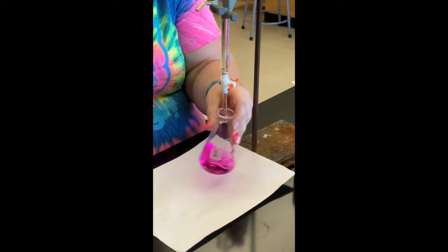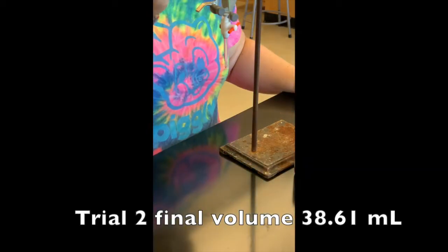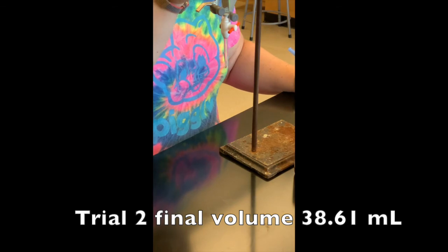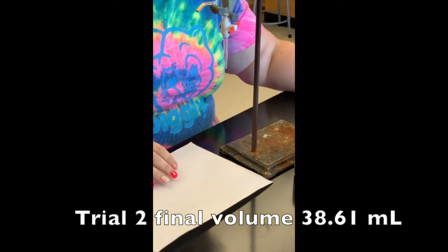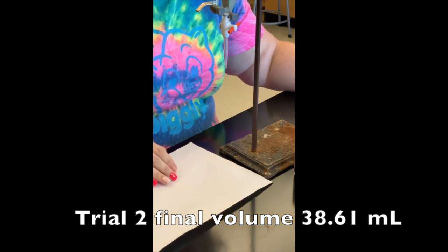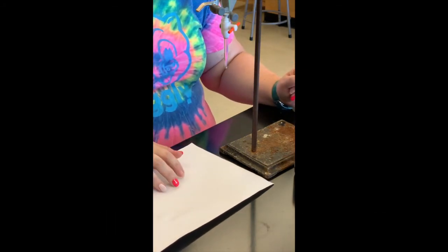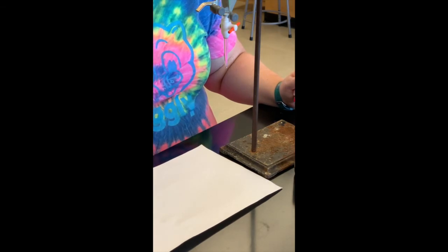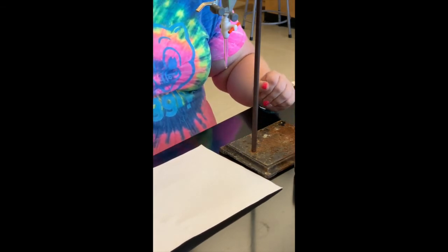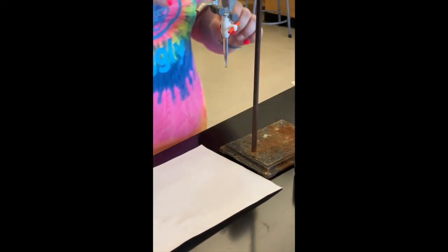We're going to take the final volume. The final volume for trial two is 38.61 milliliters. At this point I'm going to refill the burette — I still have trial three to do and also Part C. I'm going to fill it back up close to the zero mark the same way I did before.